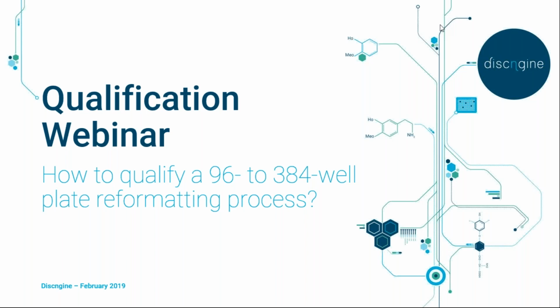All right, hello everyone. Thank you for joining us today for this second webinar of qualification. Today we will address the question: how to qualify a 96 to 384 well plate reformatting process?